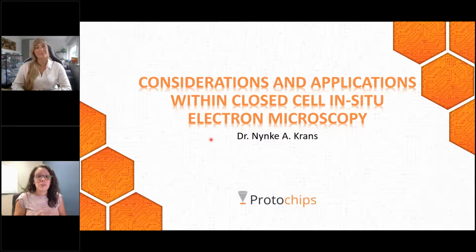And today we're kicking off our new webinar series surrounding sample preparation for in situ transmission electron microscopy. We felt that this topic was an important one to focus on because sample preparation is such a critical component to a workflow that can really affect reproducibility of an experiment as well as the validity of the results. I guess this can be said for really about any analysis technique. However, when you're working at the nanoscale, this means that even small variables in your sample preparation can cause really great differences.